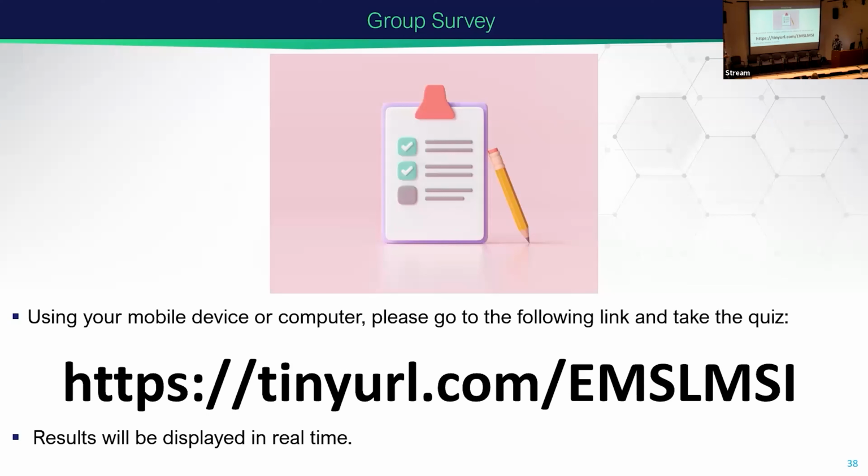But we can get these into open formats and share them online within portals like Metaspace, which is an online visualization tool, so you don't have to worry about that. There's also been a lot of work by David and Lisa, who showed the Trelliscope displays, which are just HTML links, and we can do all the visualization directly within that. Some of these computers could require, say, 100 gigabytes of RAM to run properly, but even a laptop can run a lot of this software.